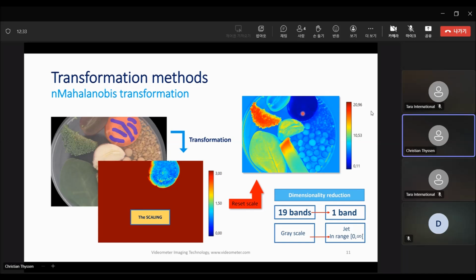However, we see that the distance between this green vegetable color, this green leaf color, is actually closer to the orange color than the color of this broccoli. However, the colors of these, I believe roasted onions and chickpeas, the colors here are closer to orange than the color of green broccoli here. So that's how you can read this image.